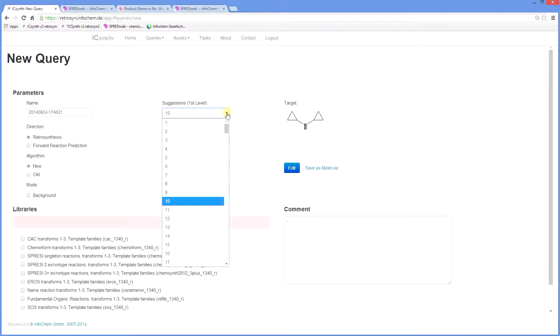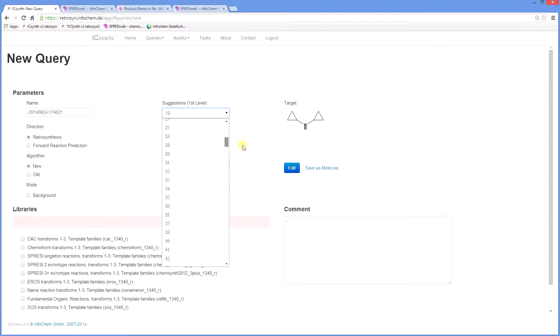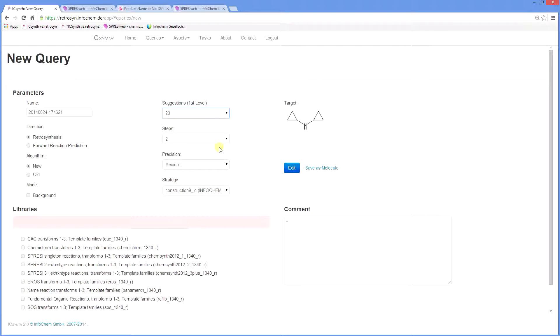You can change this to show up to 250 precursors, but we will set this for our query at 20. The number of steps is set at 2, and this refers to the number of steps back in the synthesis.